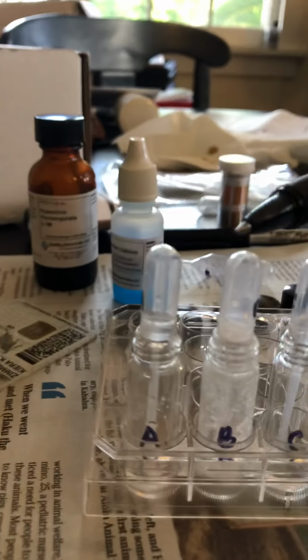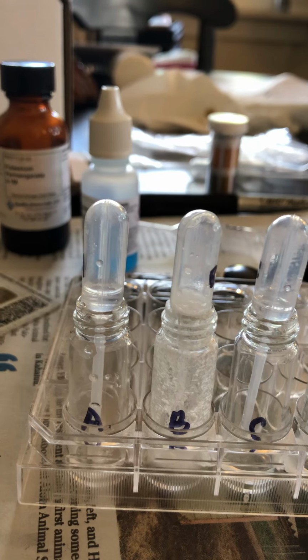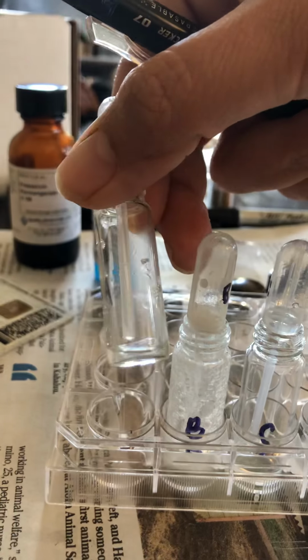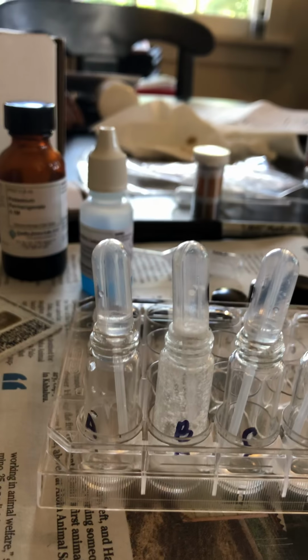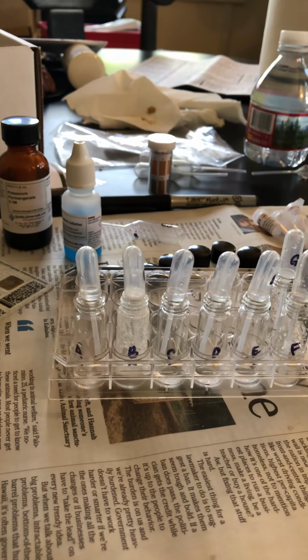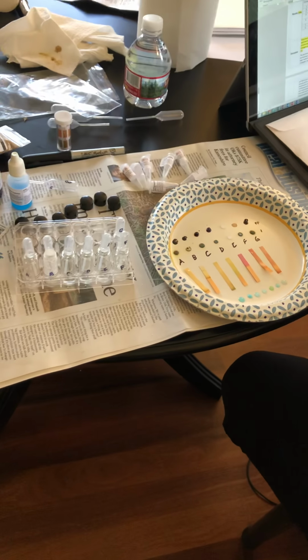I had a really hard time with this one because when I did my tests, those two compounds came out with the same results. Both of them are hydrophobic. You can see here there's some crystals, and this one is that white milky stuff that didn't mix with it very well. Both of them have a low pH. Both of them produce precipitate with the iodine test, and neither of them oxidated with the permanganate test. So I had a hard time figuring out which one is which.